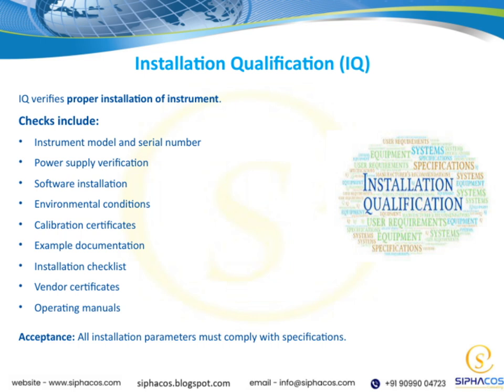Additionally, we look at example documentation, installation checklists, vendor certificates, and operating manuals to confirm all documentation is complete and correct. The main takeaway here is that all installation parameters must meet predefined specifications. If everything checks out, we can confidently proceed, knowing the instrument has been installed properly and is ready for qualification and use. This step ensures reliability and accuracy moving forward in our validation process.